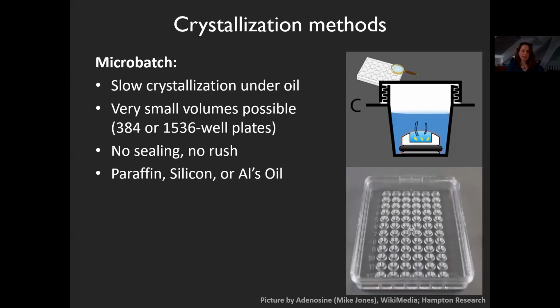The next one is microbatch. In microbatch, you only have one solution of your protein with the precipitant and salt and whatever, which is covered under oil. So on the bottom, you have this microbatch sitting there. Actually, that picture is microdialysis. I'm very sorry. But the plate is correct.